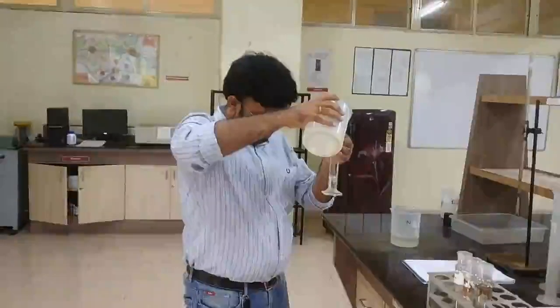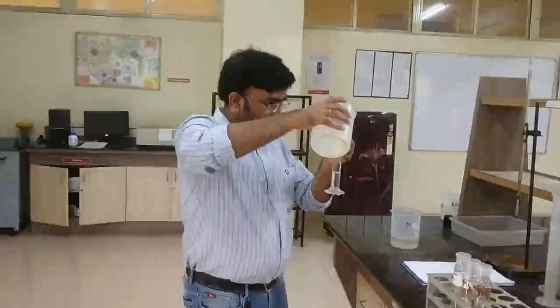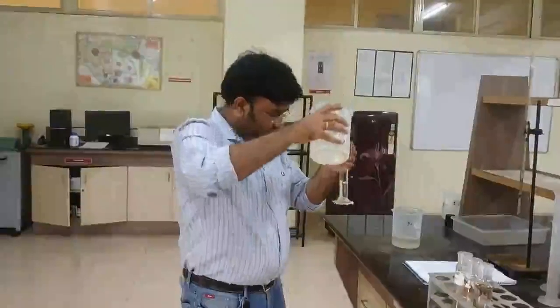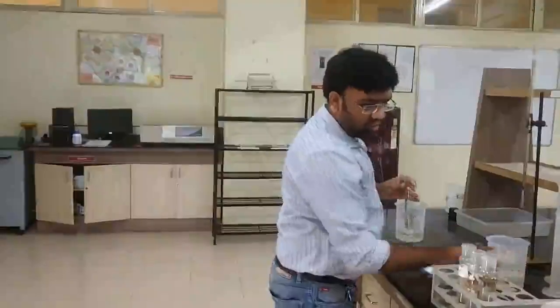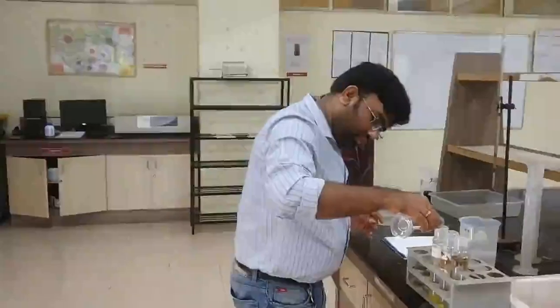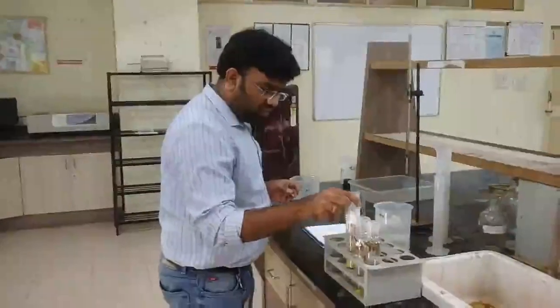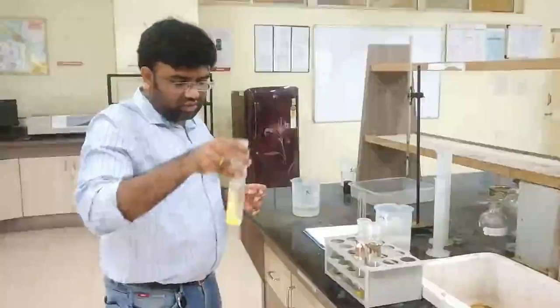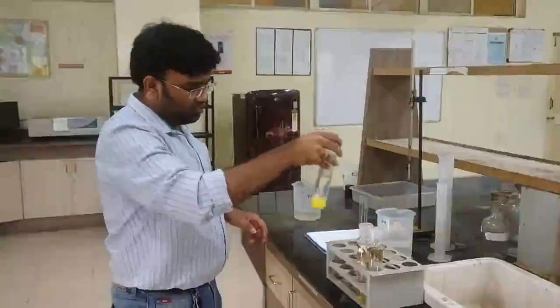So we have added only HgSO4 in all of these COD digestion flasks, right?